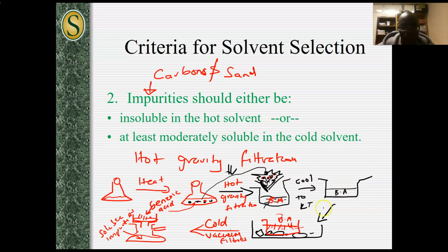So we've taken care of the insoluble impurities at this step, and now you have benzoic acid with soluble impurities. You cool it. Benzoic acid does not dissolve in cold water because of the favorable temperature coefficient. You do a second filtration, and you're left with your crystals on the filter paper. This filter paper must be pre-weighed. I'll talk about that shortly.